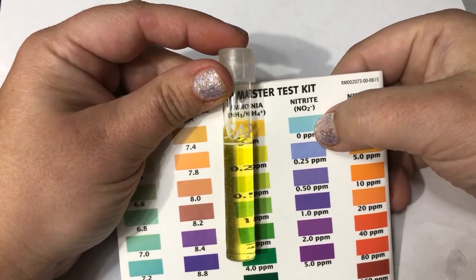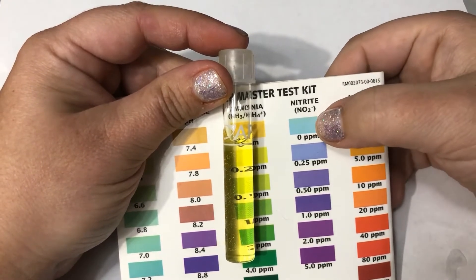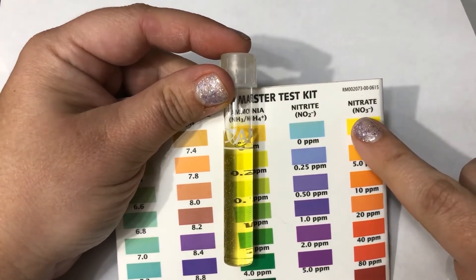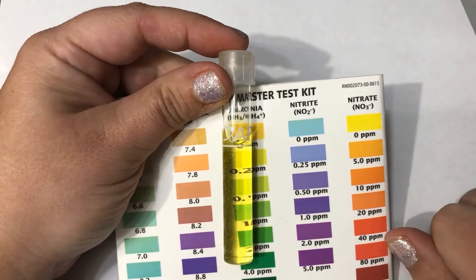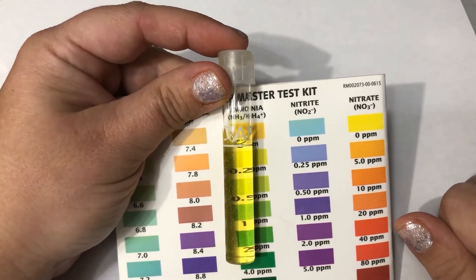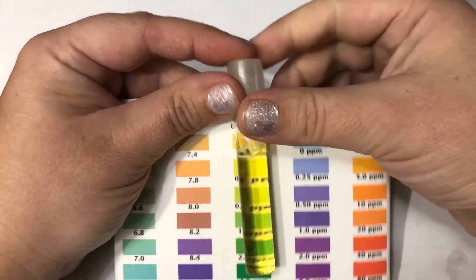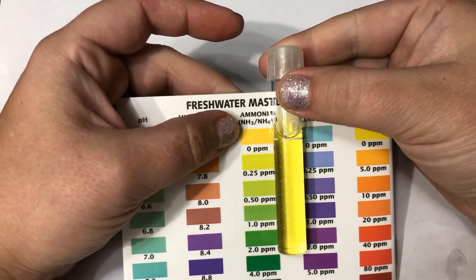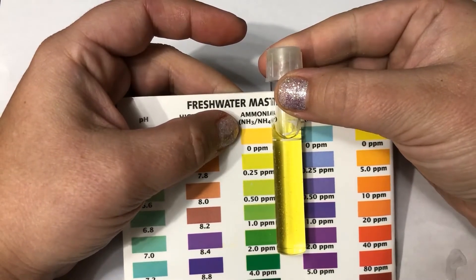Then we'll start to see nitrite go up, and a new bacteria will grow that eats nitrite and changes it into nitrate. Once we're only reading nitrate, we call it cycled — that means there's enough bacteria in the tank to eat the waste from the fish. We're seeing a little bit of ammonia, which is a good thing. That means those bacteria are starting to grow, producing waste, and starting to eat up the ammonia.